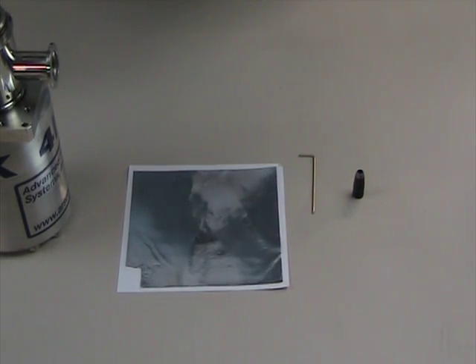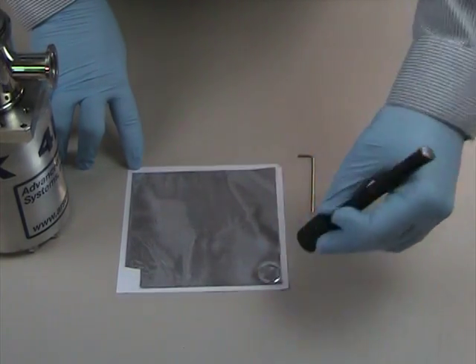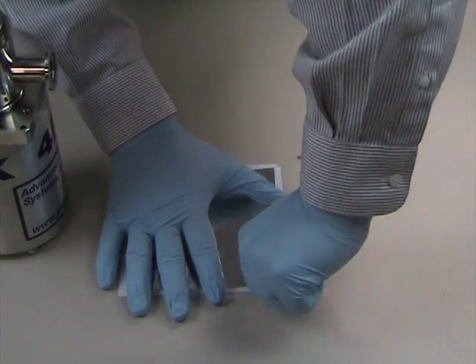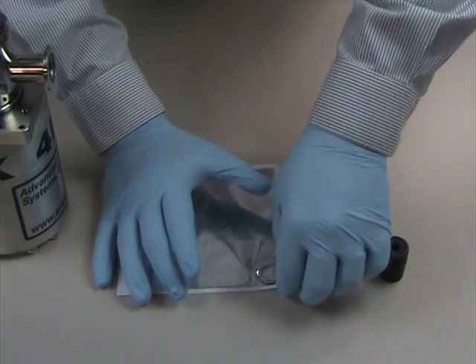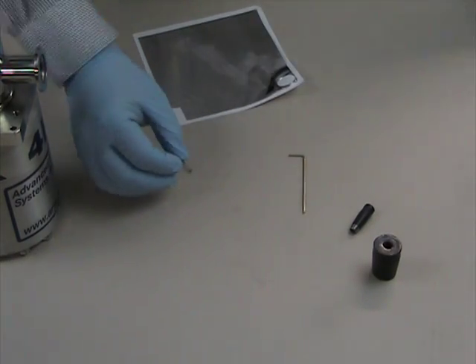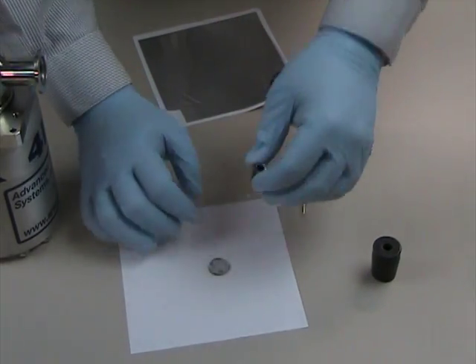You can use a 7/8ths or 3/4 inch hole punch. Once you've got the outside punched out, punch out the inside with a 1/4 inch hole punch.